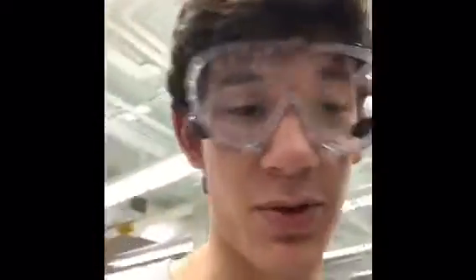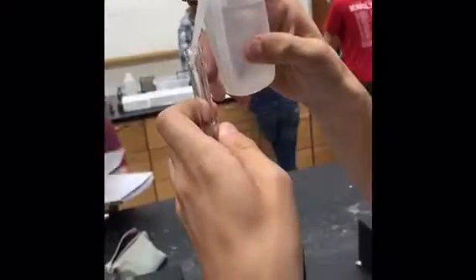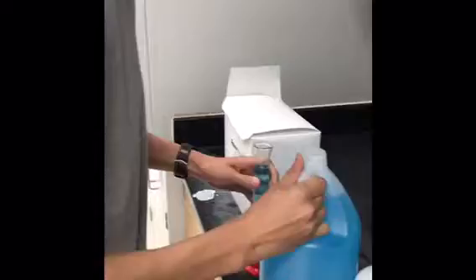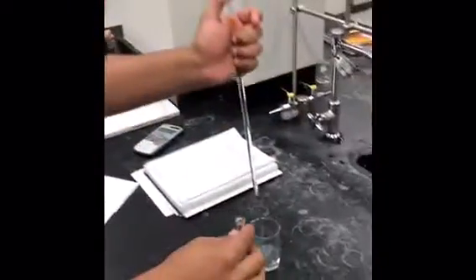I'm going to get 10 milliliters of our 20% solution and put it in our 25 milliliter flask. And then I'm going to put our 15 milliliters of water in that flask to dilute it. We have Eli, who is getting that meniscus right up to that 25 milliliter mark.